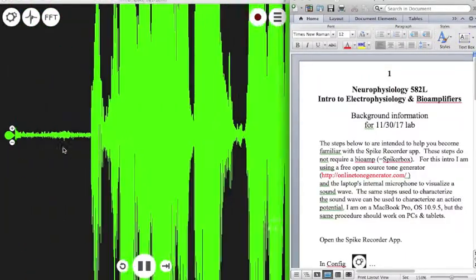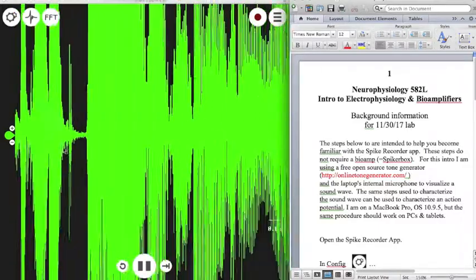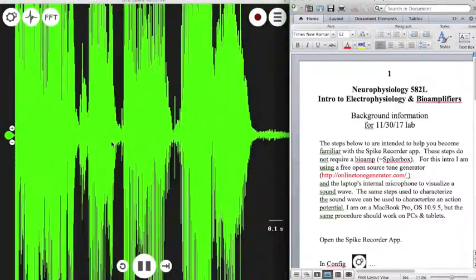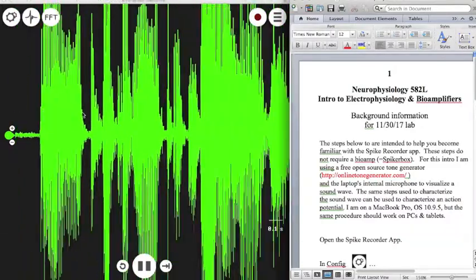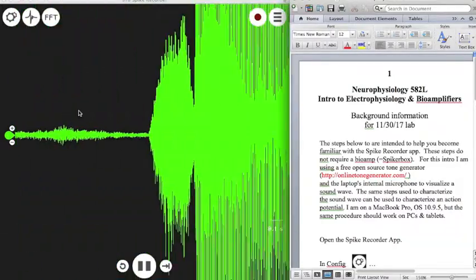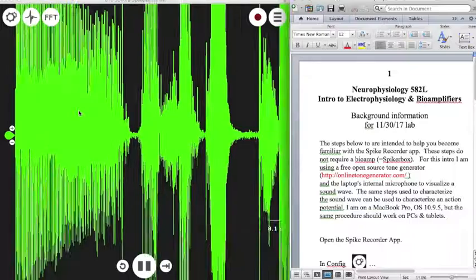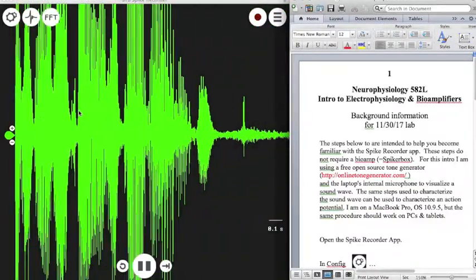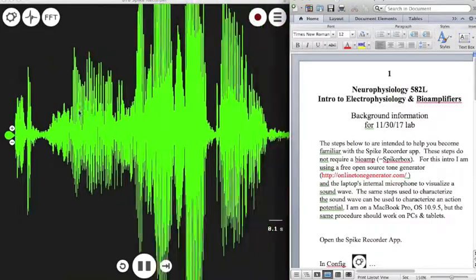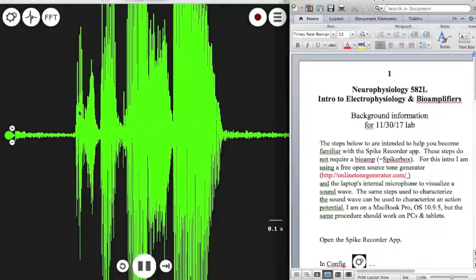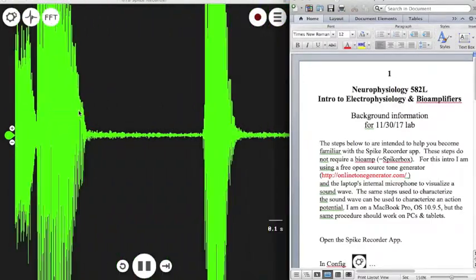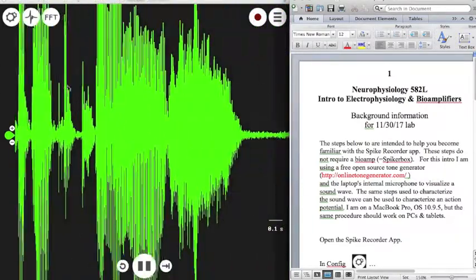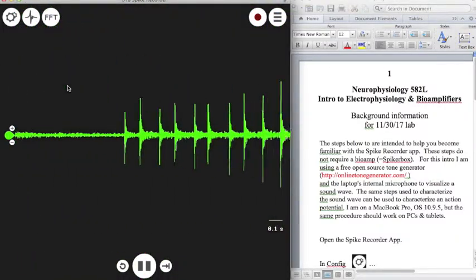Unfortunately, this mic also picks up any ambient sounds in the room, including those caused by my voice and the click of my computer mouse. So I'll have to pause intermittently to allow the sound waves on the screen to stabilize. As an example, that's my voice there — and here's the click of my computer mouse.